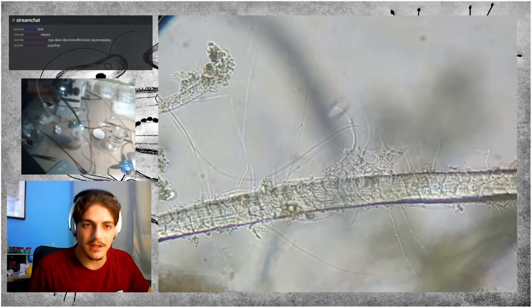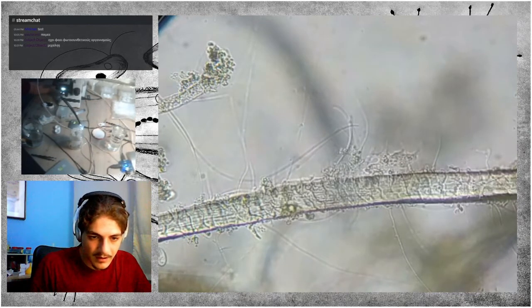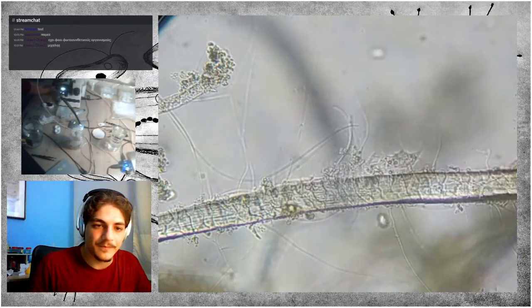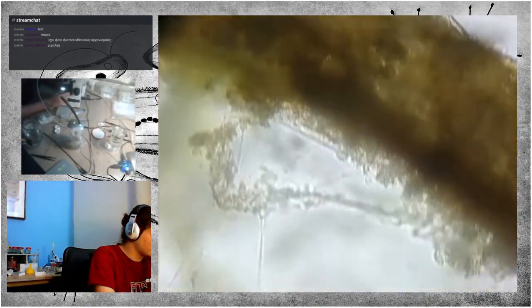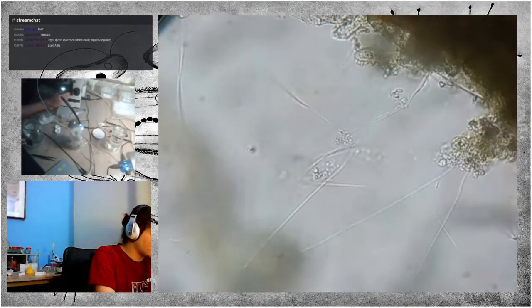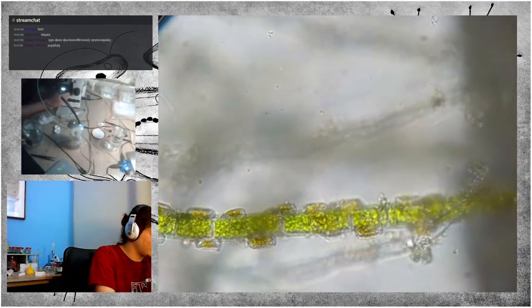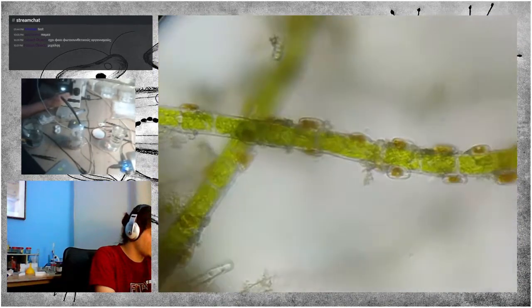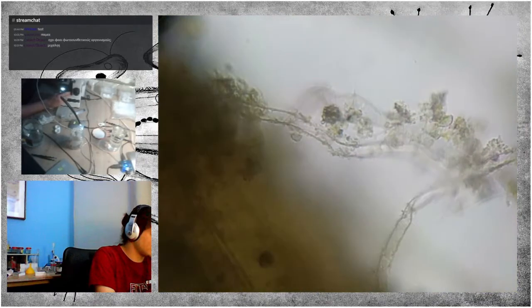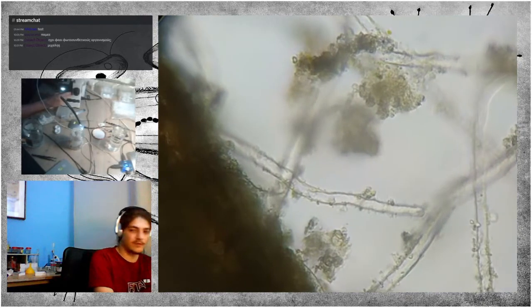Also, let me see chat right now because there have been some messages that I haven't seen. Oh, okay. Okay, let's continue. I'll be honest, I didn't really expect this slide to be that rich. I was expecting less impressive results, but I'm quite happy with the stream for now.